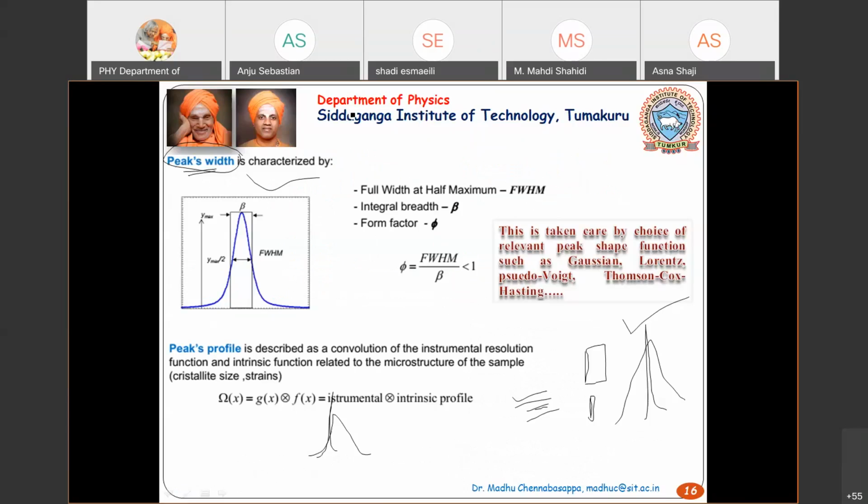It can be a solid state detector or even a gas detector. It moves in a circle, so whatever radius you take is your r. The intensity depends on this r. If you are close by, your intensity is better.